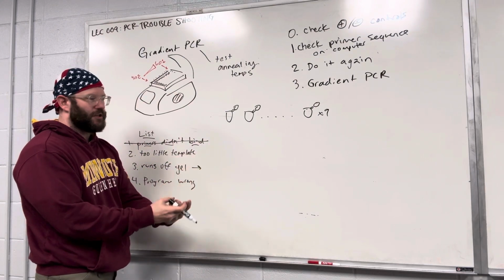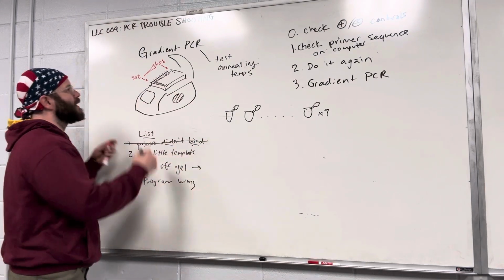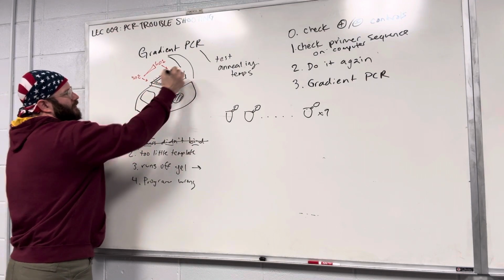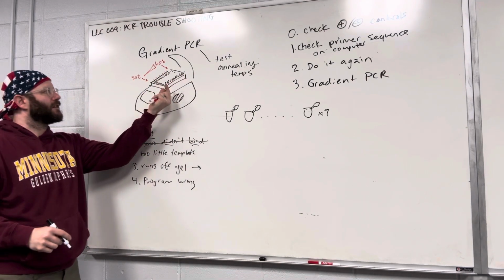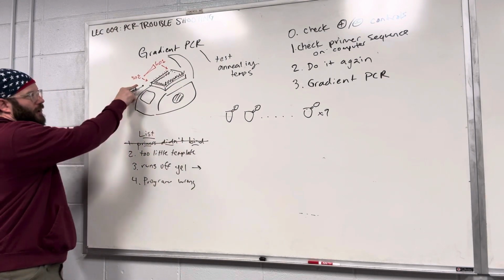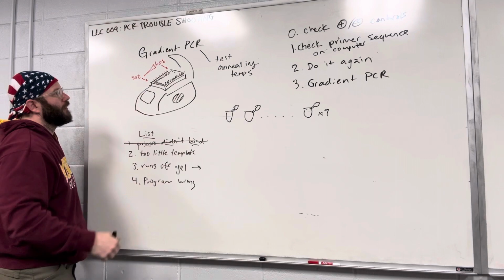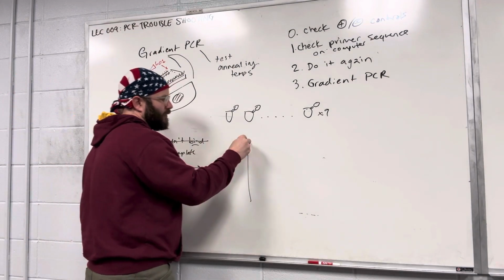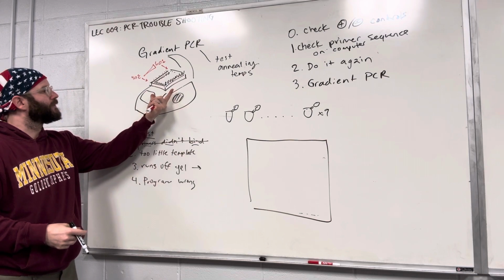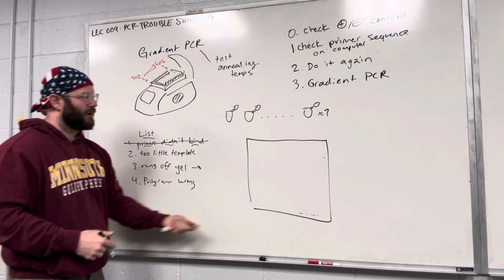Same like ingredient mixtures, etc. Then you load those into the thermocycler heating plate, program a gradient, and then you just run it, okay? And then you would run a gel from the results. So once done thermocycling, you take it out, you run an agarose gel.